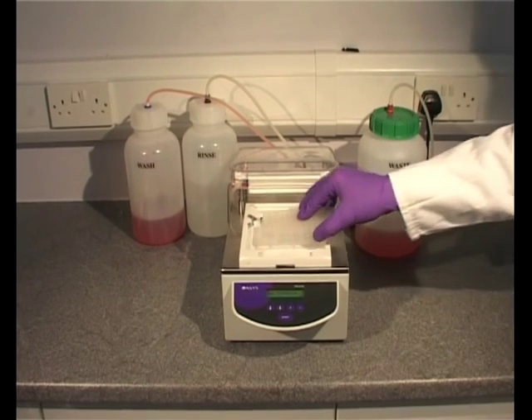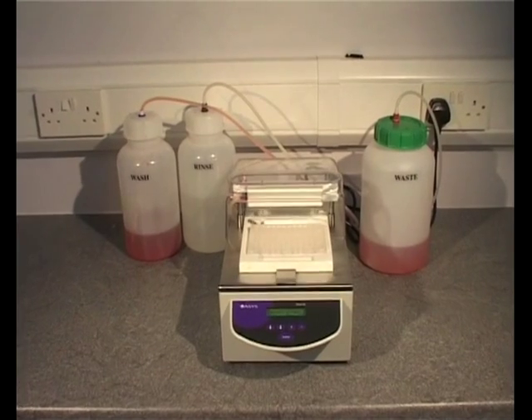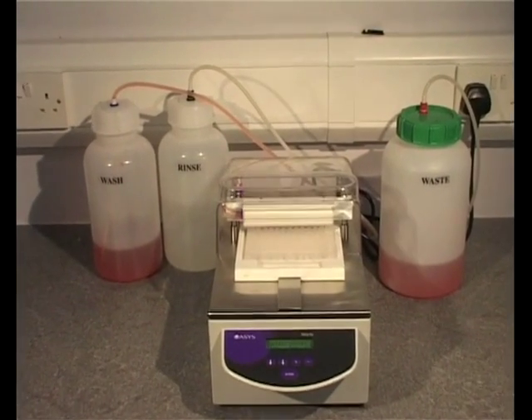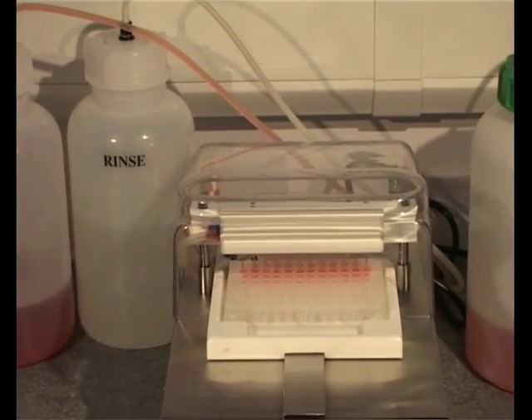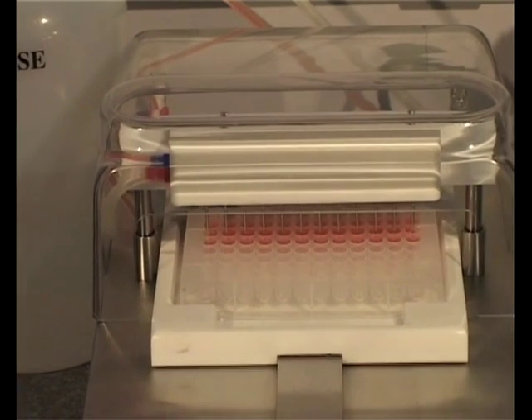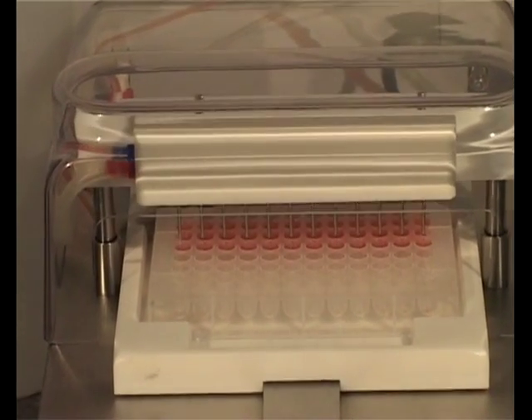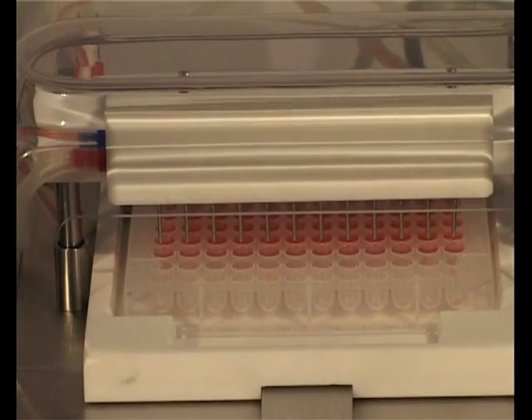A microplate is placed onto the plate carrier and a stored wash procedure started. This procedure includes details of the plate: number of wells, flat or round bottoms, the type of aspiration including time and intensity, the wash liquid to be used, along with wash volume, shaking time and intensity, and soak time if applicable.